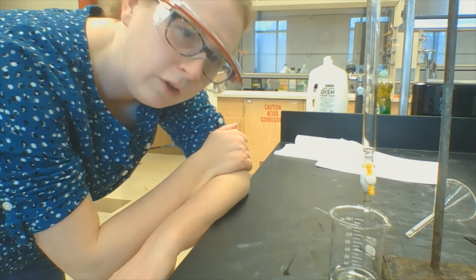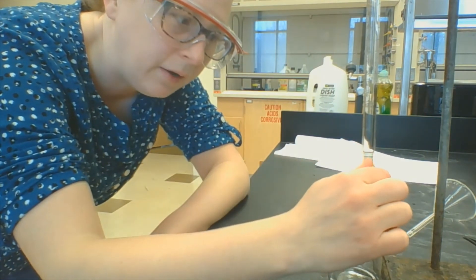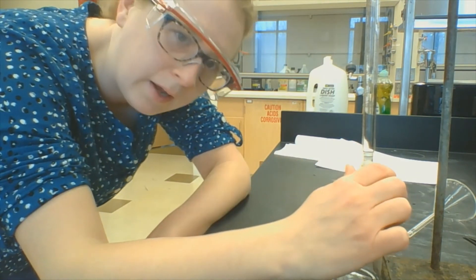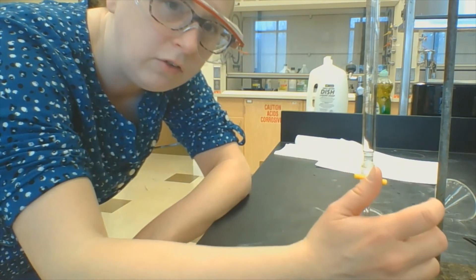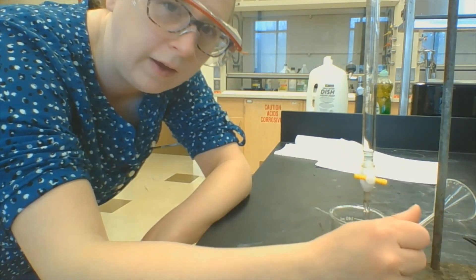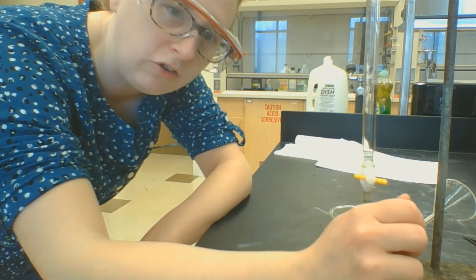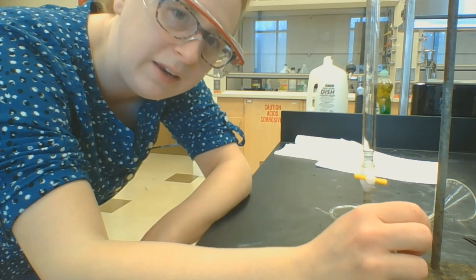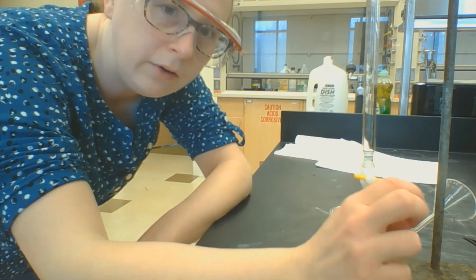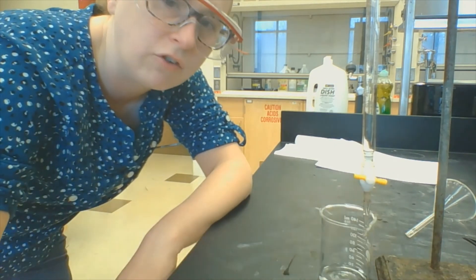Now I can feel comfortable that the burette is clean. I'm going to close off the stopcock and fill it all the way up. At this point we've talked about cleaning a burette — I want you to go through the section in your module about reading a burette, where I'll show you pictures of what it looks like when a burette is full and how to read it, since that's a little easier in pictures than in video. Then we'll come back and I'll show you an actual titration.